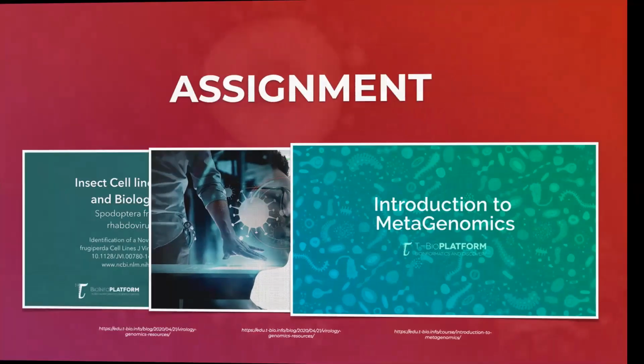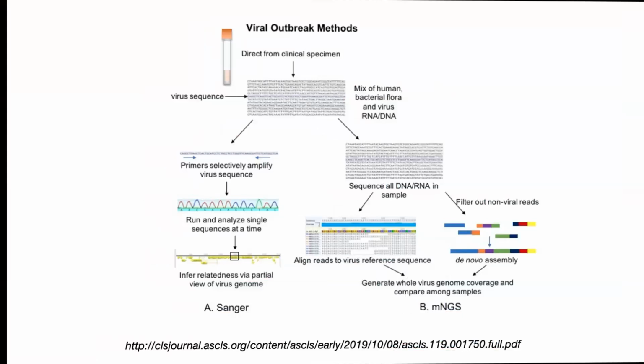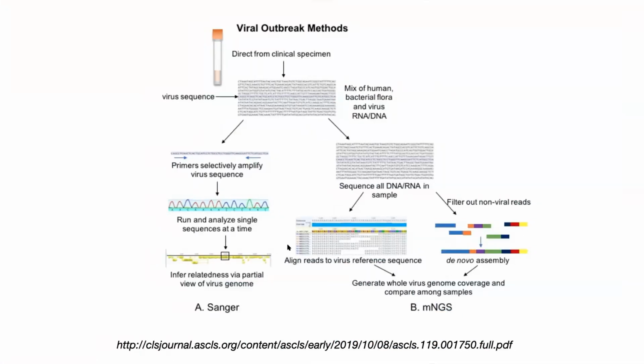Okay, so we talked about sequencing of these viral outbreaks. Viral outbreak sequencing typically relies on filtering out non-viral reads. So that example is provided in the project, the SF9 project, using that particular cell line. We can apply the same technique to study, for example, presence of viruses.